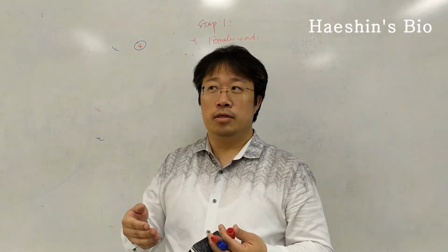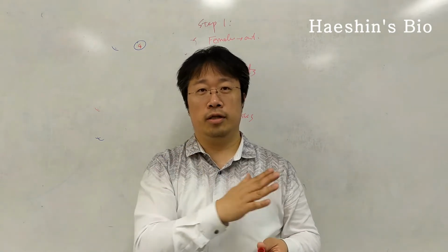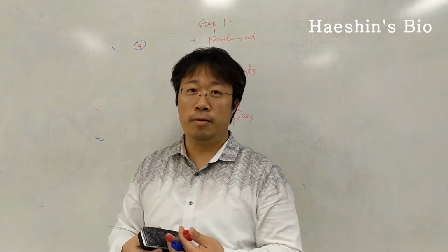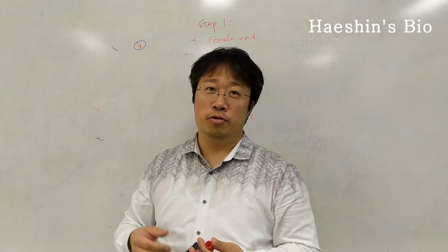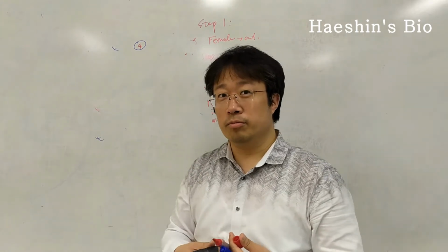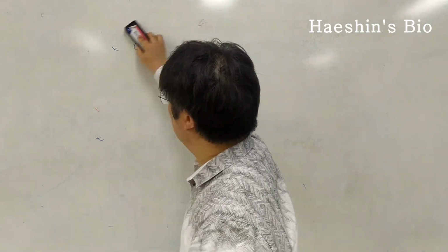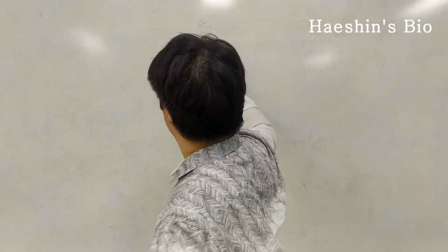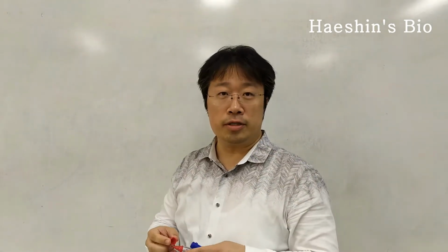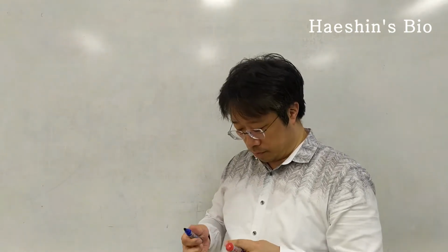But with examples, if we exclude certain categories, then we can purify successfully in an easier way, using fewer steps than you can imagine. Then you can actually purify the protein that we want. I hope this provides a good example of how we make a strategy for protein separations. So let's look at real situations now.